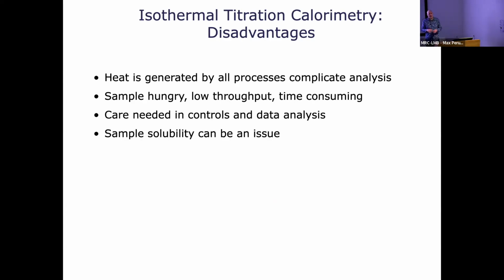And of course, you're using quite high concentrations of sample. Typically, you're working way above the KD in both the material in the cell and also what's been injected in. And of course, some proteins and macromolecules don't really like to be very, very highly concentrated.